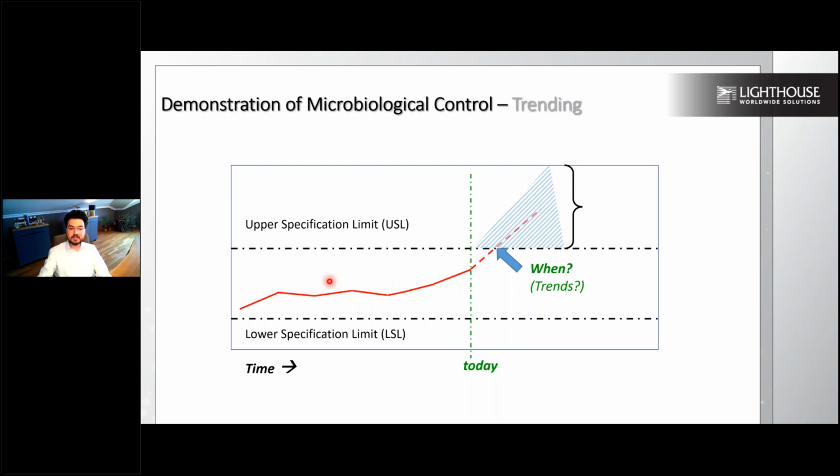However, when you have these trendings going high, this has to be investigated. The reason here, sooner or later, you might exceed the limits or something changed on your conditions. So you have to verify this information other than waiting to see the first red flag on top of your production. That's why trending and trend analysis with a good statistical calculation is the critical part of your production.